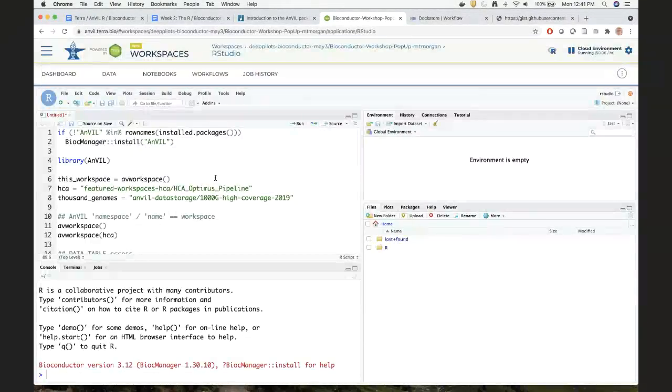We had the different workspaces. We had this data tab. We ran the script. It wrote data from a Google bucket, and it wrote data to a Google bucket. And there were all of these graphical elements that we could use to manage things.